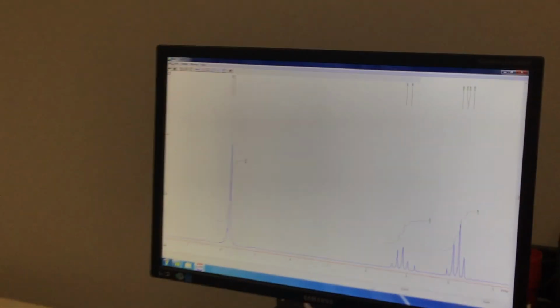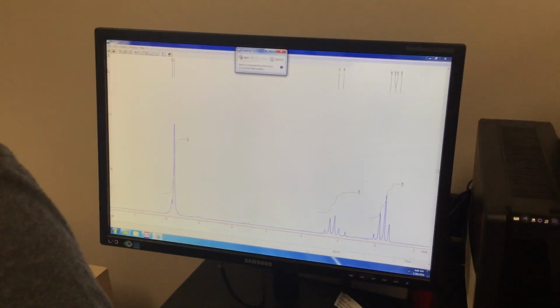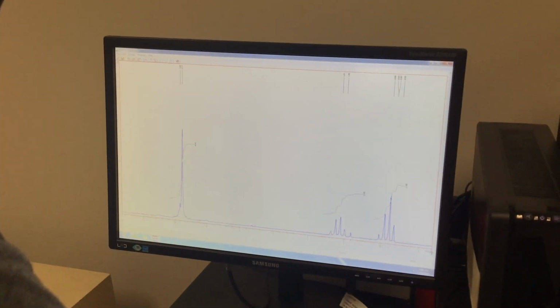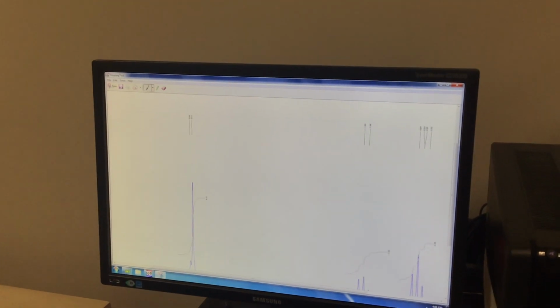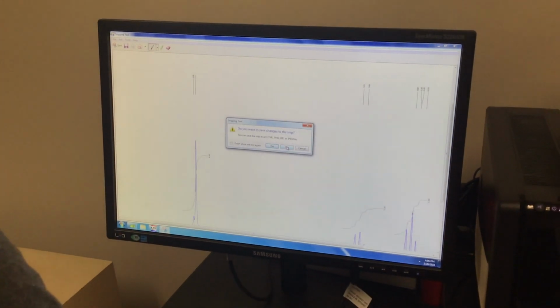And now I can either save a snapshot of this if I wanted to do, this is Windows 7, so I probably won't do that. I can go to snipping tool, and I can create a new, and then I can pull everything of interest in here. Be a little more careful with how you do it. I'm just doing this very quickly. And then you can see everything that's of interest on this graph, and you can save it wherever you need to save it, onto USB.